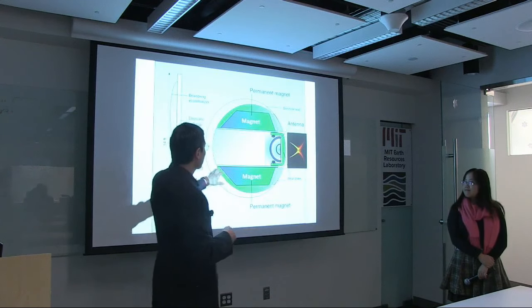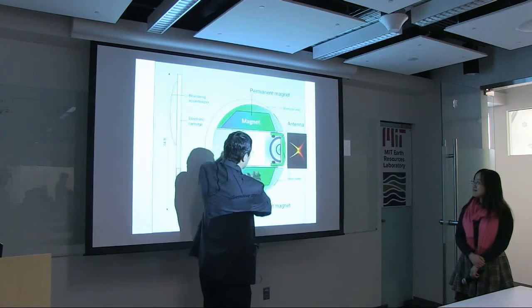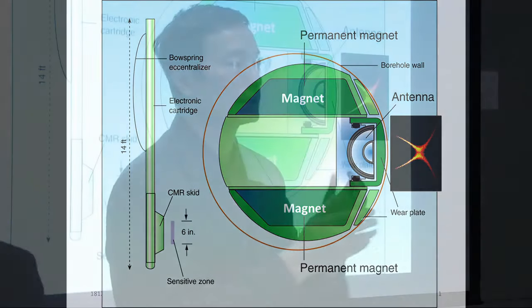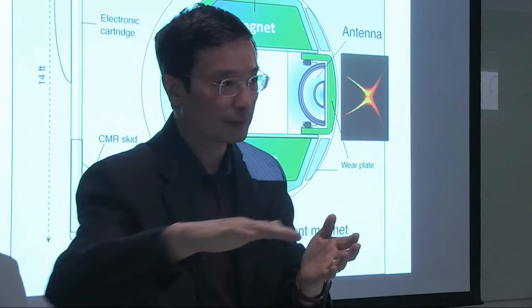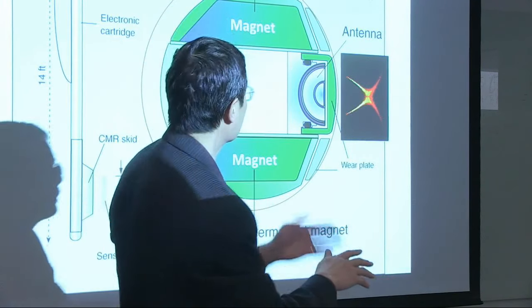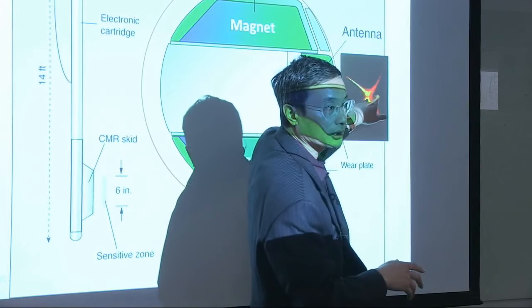Right. So of course, when you make a magnet, let's forget about the details of the magnet, the magnetic field falls off as you go away. So if you set to operate at a frequency, let's say we operate at 2 megahertz, it typically is at a magnetic field of about 500 Gauss. If this is 2 megahertz, then this is where the 500 Gauss is.